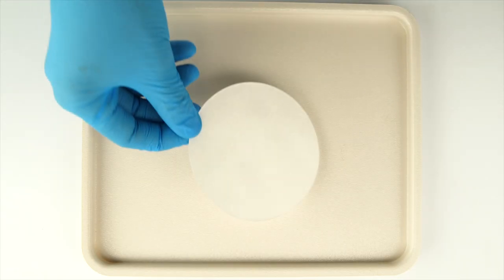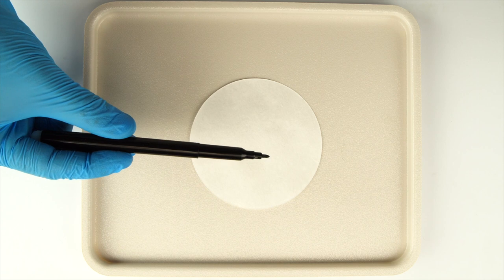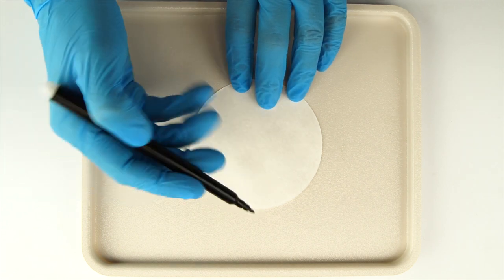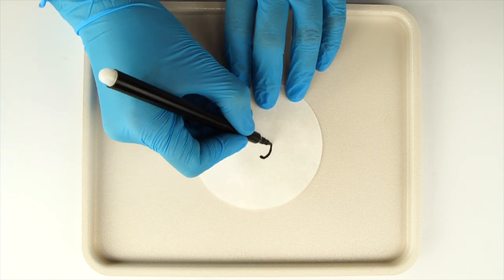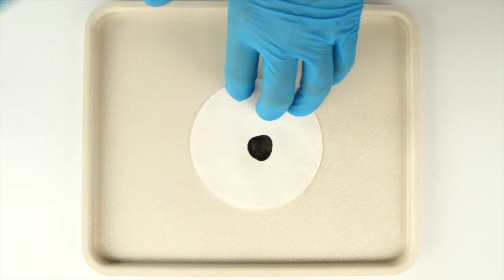First, take a piece of filter paper. Using the marker, draw and color in a small circle on the filter paper. Make the circle about one centimeter, a bit less than half an inch in diameter.